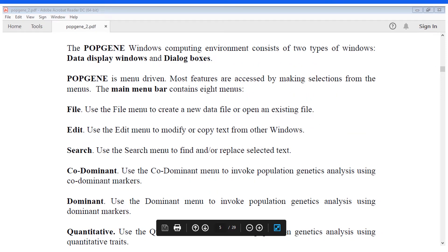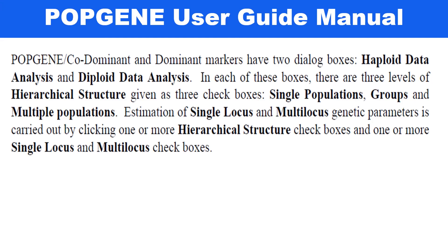The Popgene Windows computing environment consists of two types of windows: data display windows and dialog box windows. The screen of Popgene software starts with the menu bar containing File, Edit, Search, Co-dominant, Dominant, Quantitative Traits, and Help.